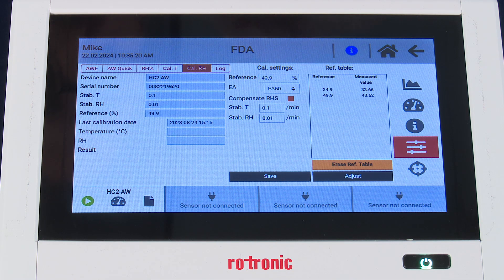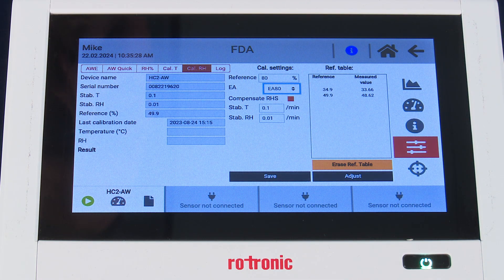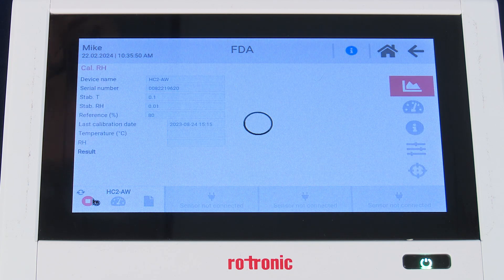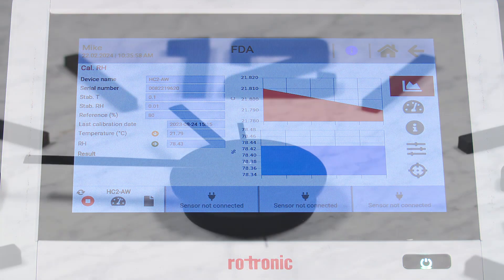We want to change the CAL settings to reflect the new humidity standard. In this case we scroll and select 80% RH. We verify temperature stability at 0.1 and RH stability at 0.01, and we save these settings. The green bar at the top indicates we've successfully saved. Now we're ready to begin the next measurement by pressing the green arrow in the bottom left of the screen. The spinning arrows indicate we are in measurement mode, and this measurement will run 30 to 60 minutes.